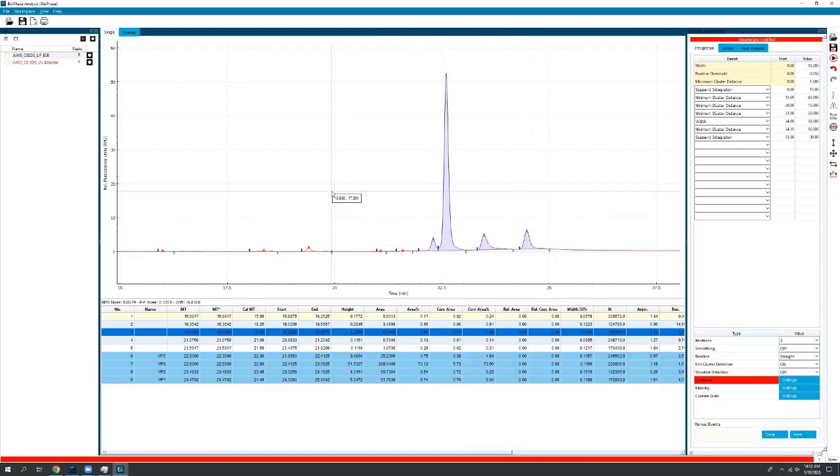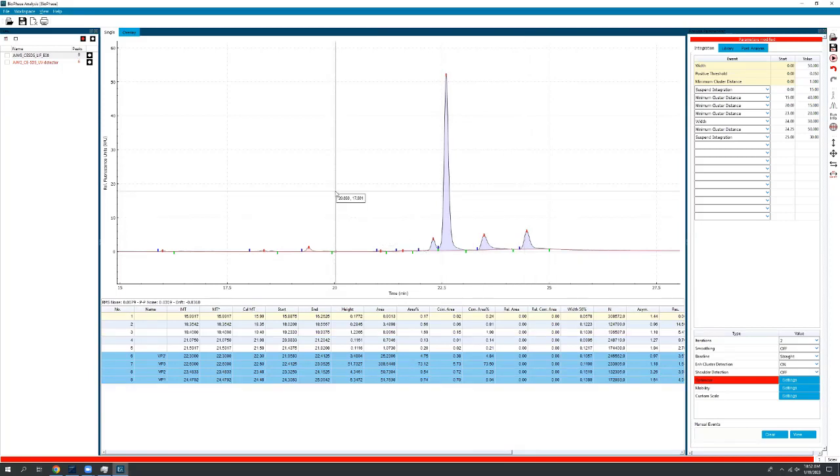So that's something that I've definitely talked with customers about, who are monitoring their cell culture process, how that affects the VP expression, and how this VP ratio also can affect the efficacy of a product down the line. So how that capsid is coming together out of cell culture can obviously have a big impact, not just the purity of the capsid and how many related substances are there, but how well it actually came together with those subunits.